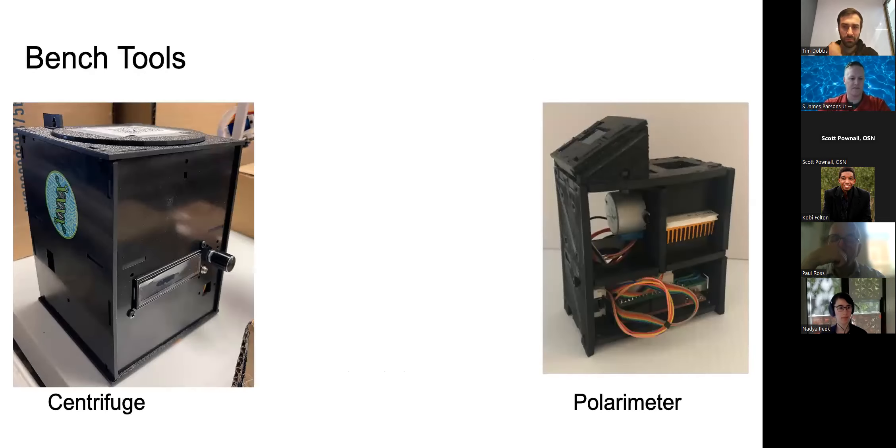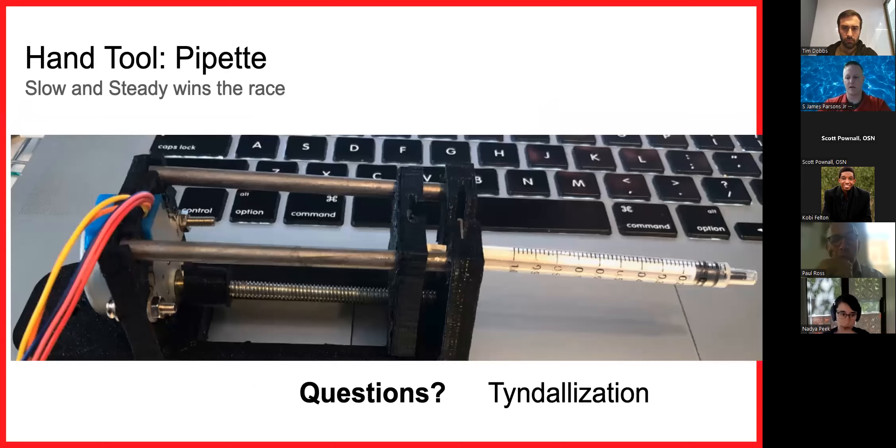Here are some bench tools: a centrifuge on the left from Biohack Academy, and a polarimeter I created on the right — both with RJ11 ports on the back. As a hand tool, I created a pipette that uses glass syringes and glass tips, boiling between reactions for sterility. It's very accurate and costs five dollars. It's slow compared to Opentrons, but the lead screw is very accurate for depositing small amounts of liquid.